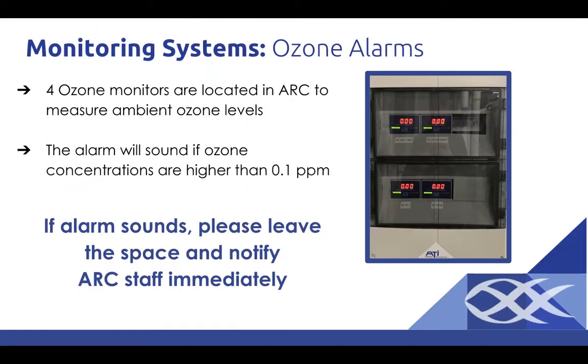Ozone monitors measure ambient ozone levels in the space. There are 4 ozone monitors spaced through the ARC facility to measure ambient ozone levels. The alarm will sound if ozone concentrations are higher than 0.1 ppm. If this occurs, please leave the space and notify ARC staff immediately.